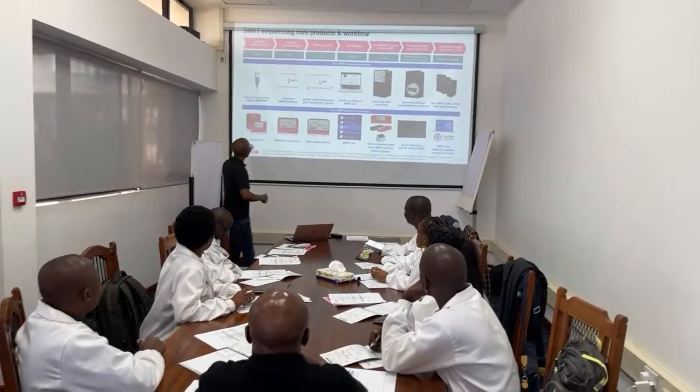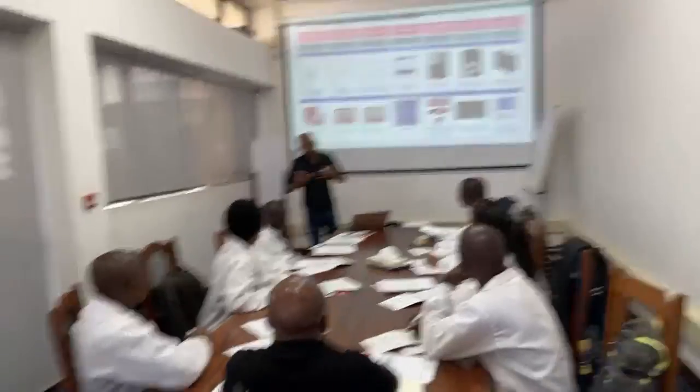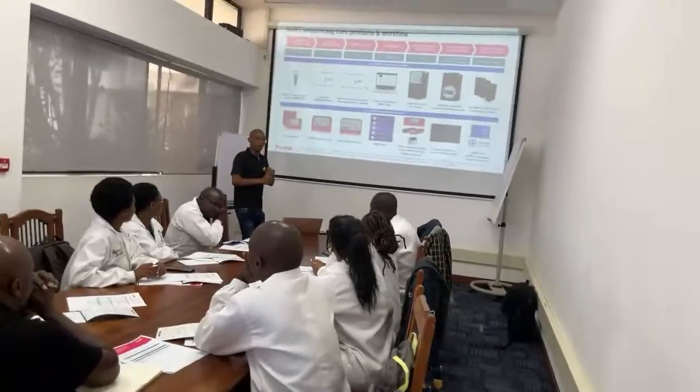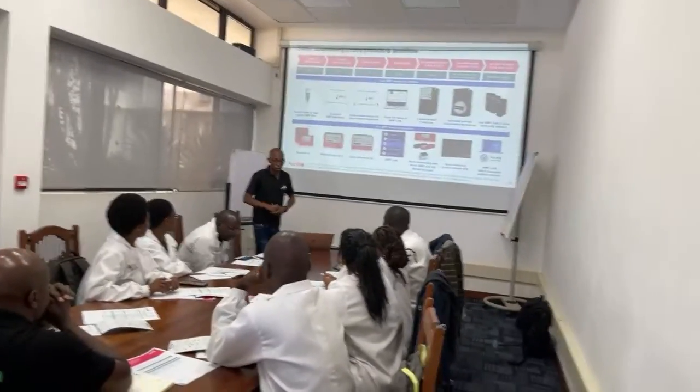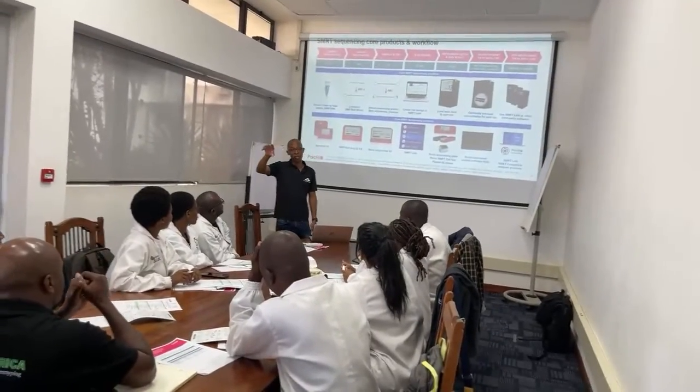Hopefully we finish today. And then the second part will be QC, just to see how much DNA we've got. And then from there, we do the shearing. You will see the instruments in the lab. We came with them from South Africa.